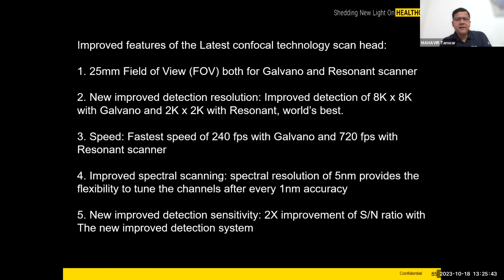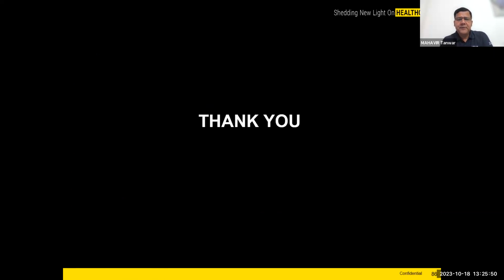Of course, wide field and speed are necessary these days, and of course, sensitive detectors are there these days. So this is more on confocal. Now I want to start super resolution. Is that okay, sir? Any question?